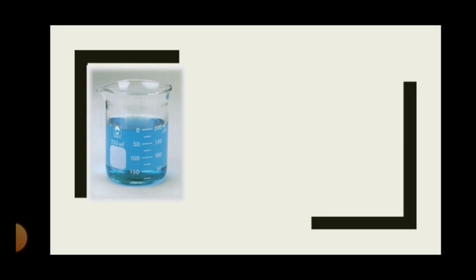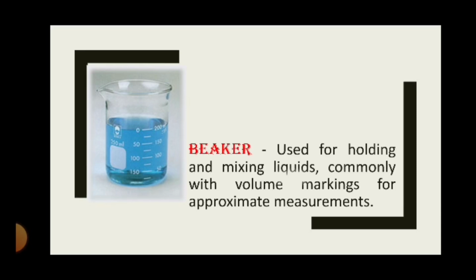Okay. Where are you? What is this one? Can you guess? Wild guess? Well, yes, that's correct. Sabi ko na nga ba, matatalino kayo. This is beaker. Ano bang function ng beaker?